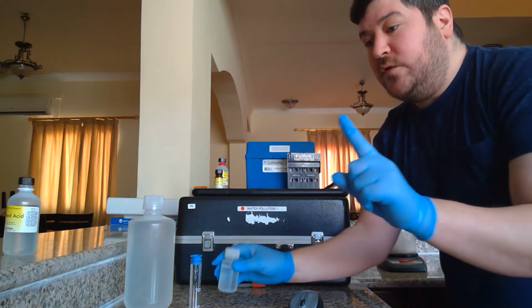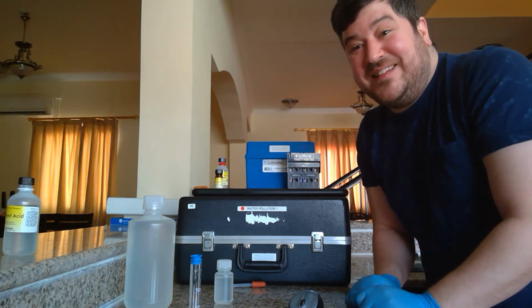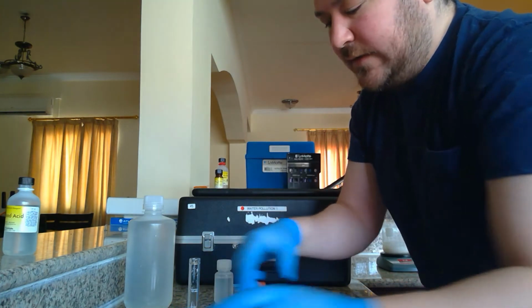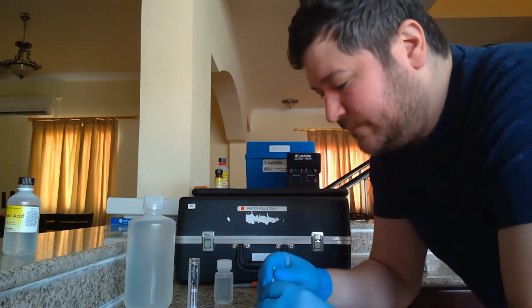So I am going to add 1 scoop of reagent to this and shake it 60 times and then wait 10 minutes, and we'll be back. I might do a little fast forward here, obviously. So I'll see you in 10 minutes.